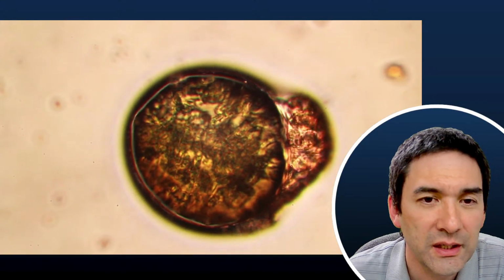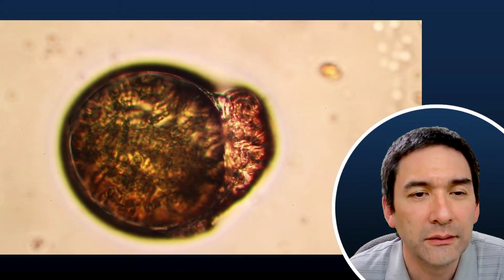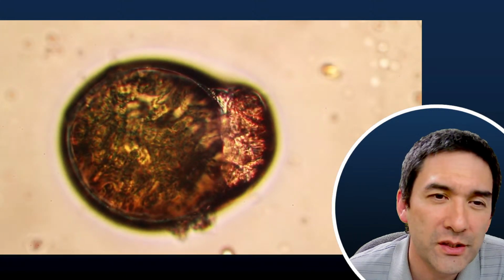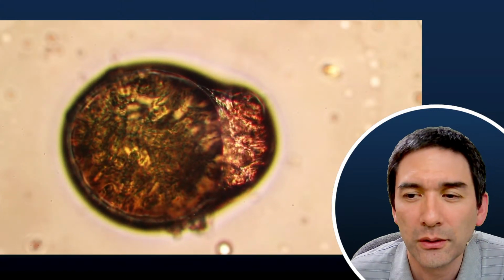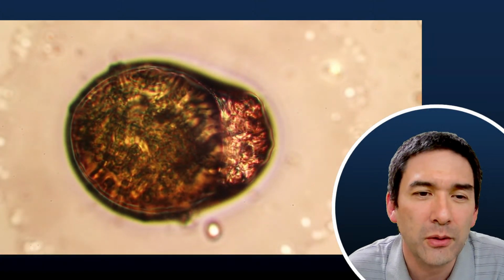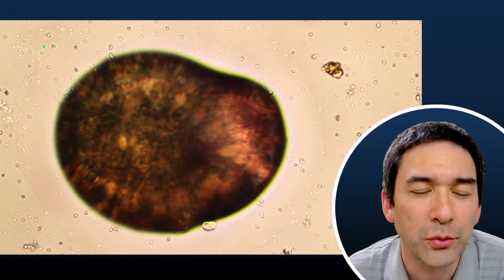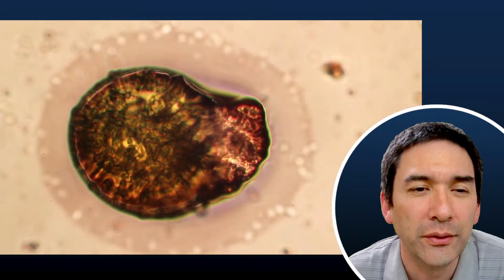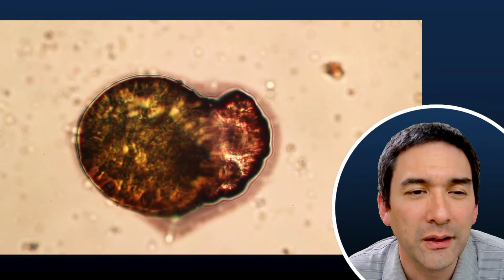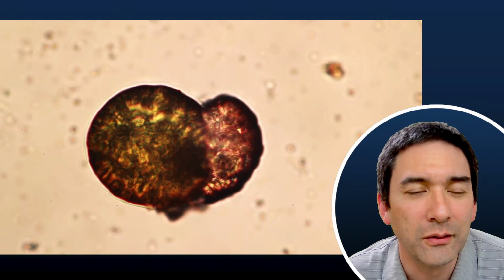I was focusing again, and there's now a very small water drop, and the water evaporates more and more. The tardigrade starts to become smaller and smaller. You can maybe also see that because the water droplet starts to pull together around the tardigrade. You see now it starts to dry up. Okay, and it's dry, or almost dry.